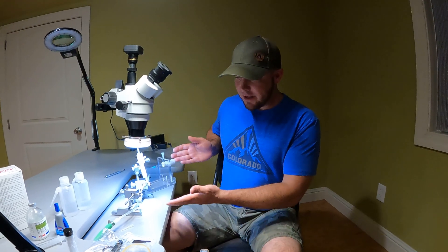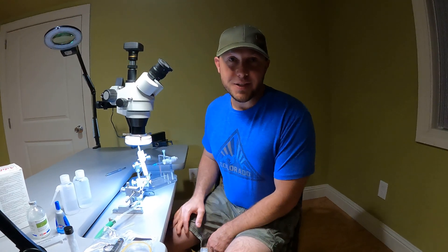Hi, I'm Corey Stephens, grad student at UNL. I own and operate Stephens Bee Company and our main focus is breeding honeybees for mite and disease resistance. In order to best do that, we utilize instrumental insemination.